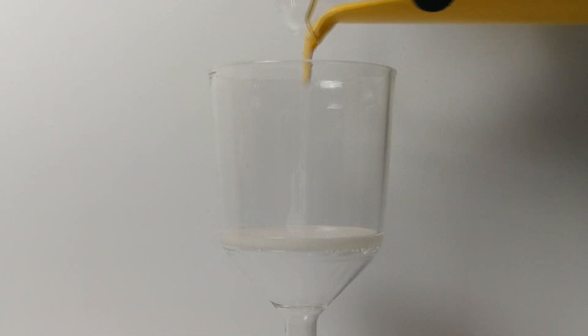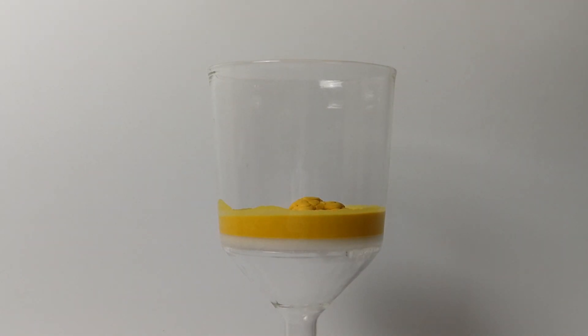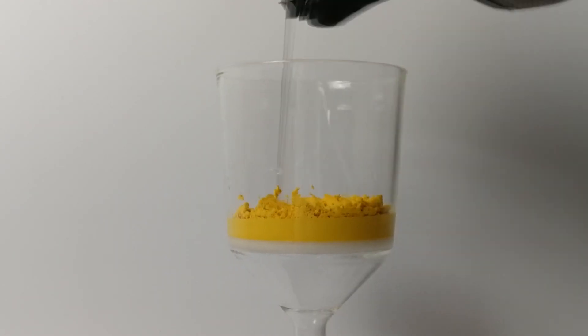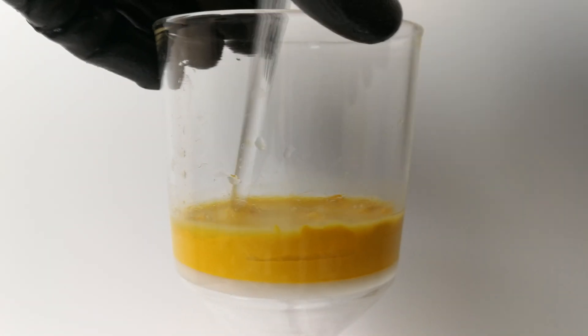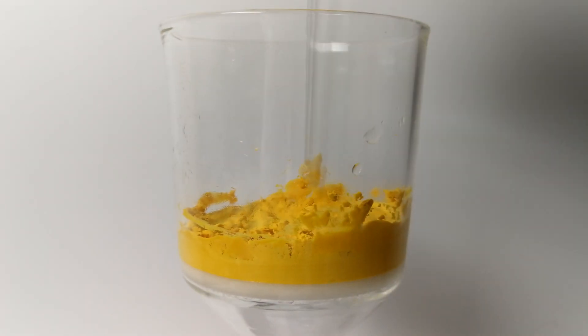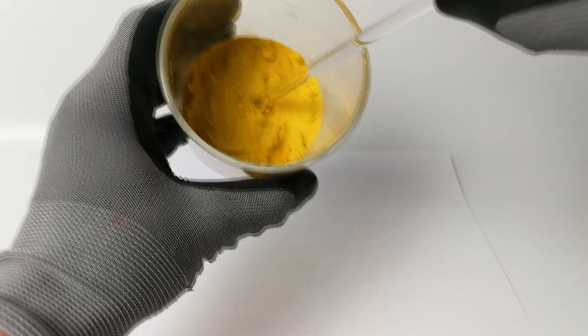The precipitate is then added to a glass filter funnel. Just in case, I decided to give it another wash. The precipitate is then scraped out of the funnel, dumped onto a piece of paper and left to dry.